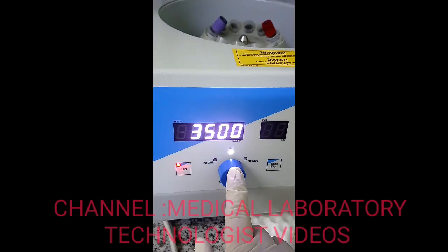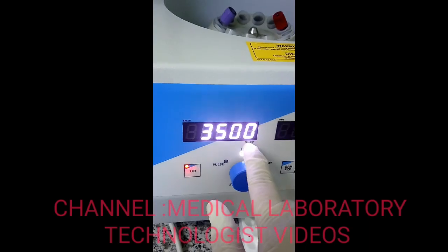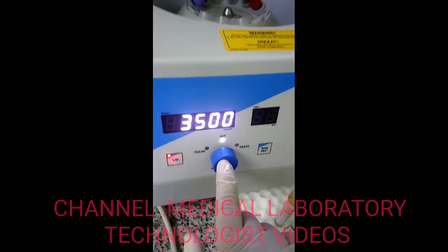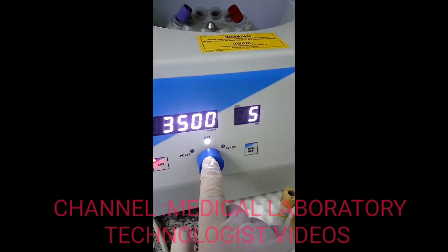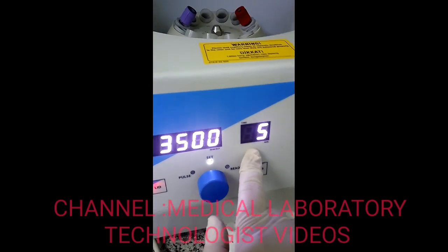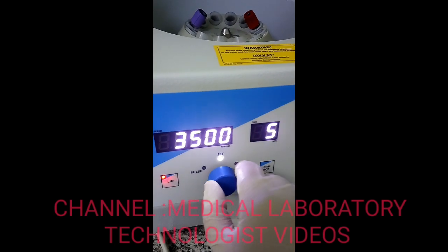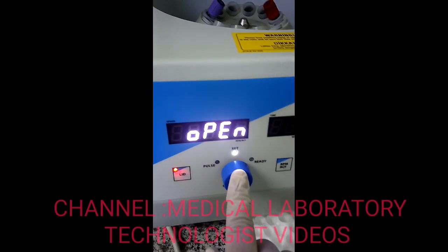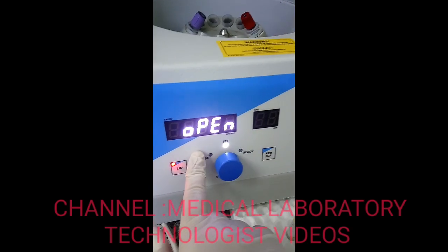I will click the set button and the speed display will come up. My requirement is 3500 RPM, so I will adjust it using the knob. For time, the minimum I will set is five minutes. You can increase or decrease the time by turning the knob clockwise or anti-clockwise. Once my speed and time are selected, the display shows it is ready to run.